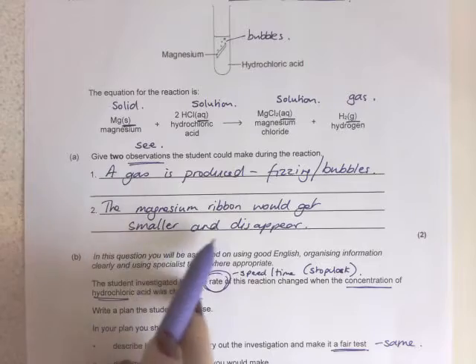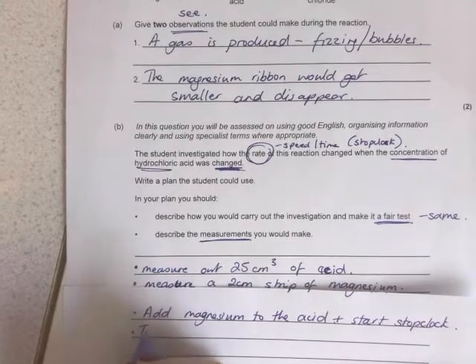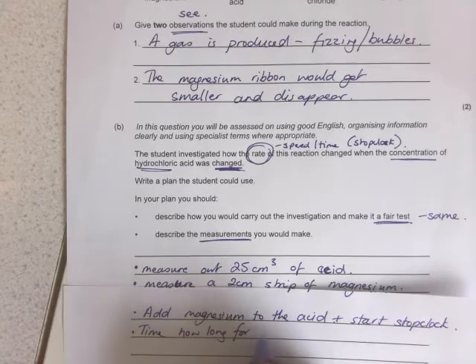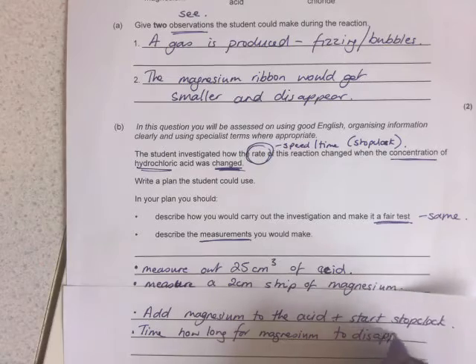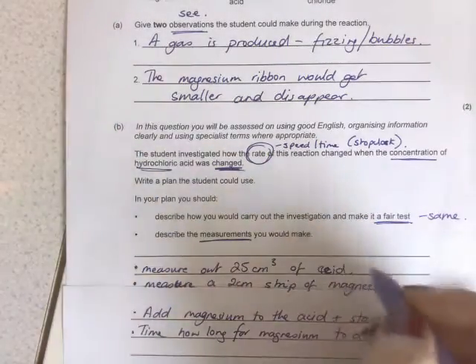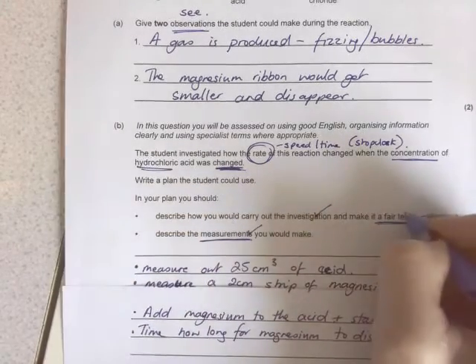Or I could time how long it takes for the magnesium to disappear. I'm going to do that one. So time how long for the magnesium to disappear. I've done measuring, so I'm going to tick that off. Carry out the investigation, I've done that. Fair testing, I've done.